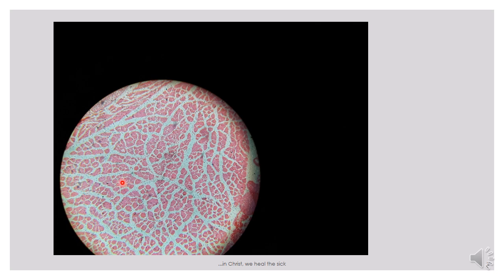The whole muscle mass is actually invested in a sheet called epimysium. It might not be very clear in this slide, but at the end, the whole muscle fiber mass is invested in a sheet called epimysium.